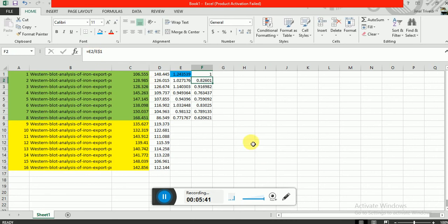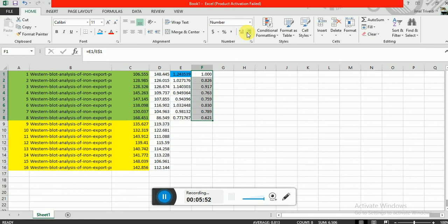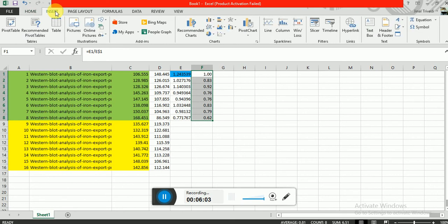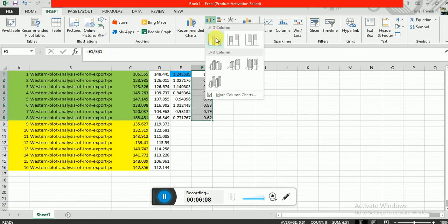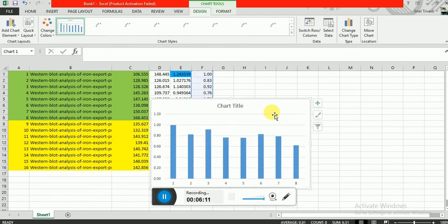So compared to this control column, control sample, I will find this value. Now if I want to make a graph, I will do insert and make a graph.